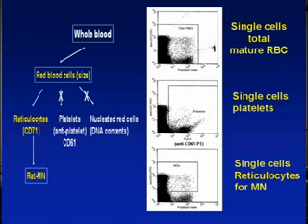And that's the logic of thinking. So the first thing is that you want to eliminate these cells. You look at the propidium iodide DNA content versus the CD71, that's the reticulocyte. Since the immature cells contain a much higher amount of DNA, it will show the DNA content in this area. So you put an area, we call a region, saying that the first step is that I only want to look at the red cells.